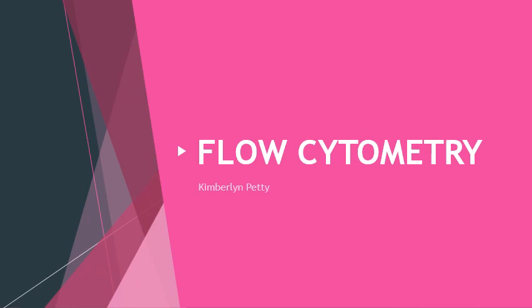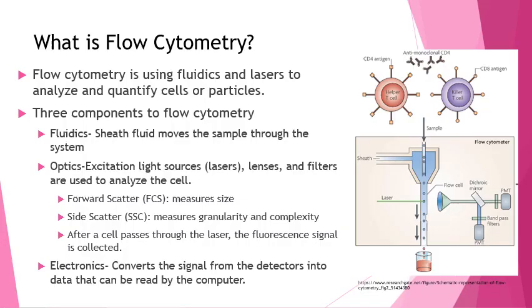Flow cytometry is an application that I use all the time in my current career, and I think it's actually just a really cool application, and I'm really excited to talk about it with you guys today. So what is flow cytometry? Flow cytometry is using fluidics and lasers to analyze and quantify cells or particles.